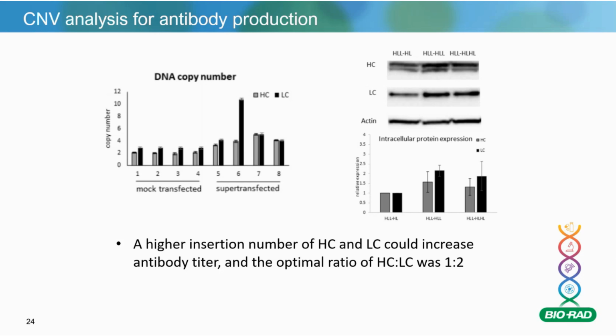And top is the Western blot showing the heavy and the light chain protein abundance. So you can just see how this copy number variation has actually played a huge role in the quantity of antibodies that they're actually able to produce in this industry. So a real material impact. But this is just one example in biopharma. Of course, copy number variation plays a massive role in a lot of human and various organisms' life cycles and studies as well.